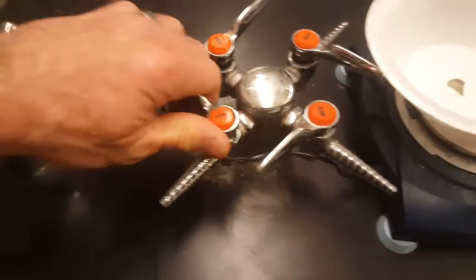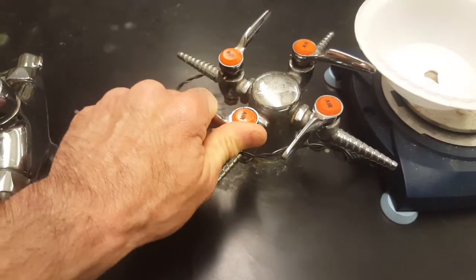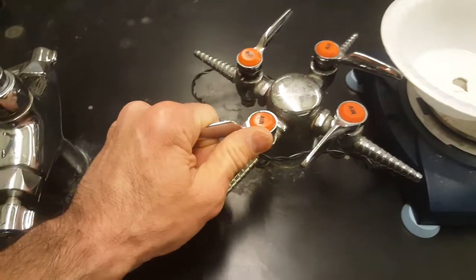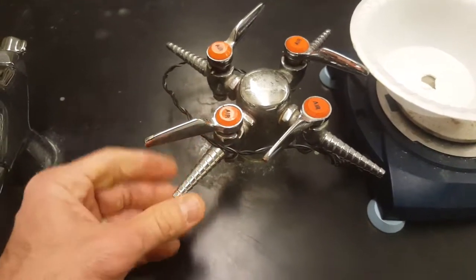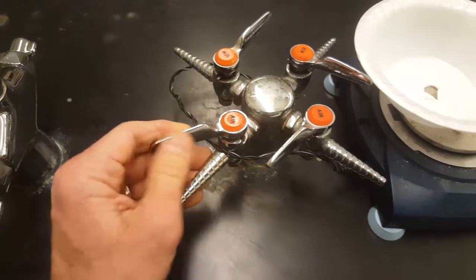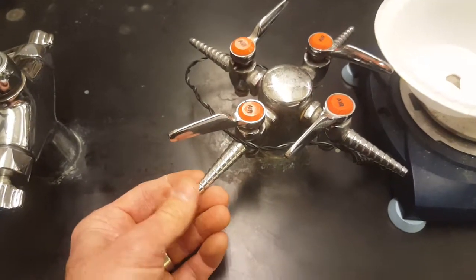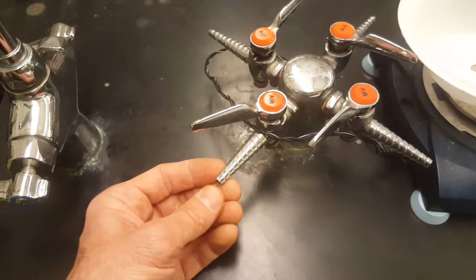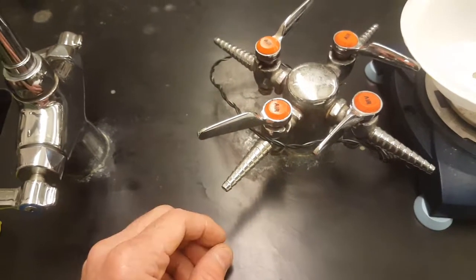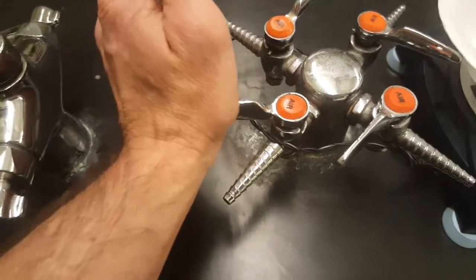Here's the air. The trick about using the air is that if you turn this up all the way, water vapor is going to come out and you'll ruin the experiment and you'll ruin the bag for all the other classes today. But if you turn it on just barely enough that you can hear it, then no water will come out, and the air should have a similar humidity to what's in the room. And that's what we're trying to measure. There might be some error with the air. Ba-doom.